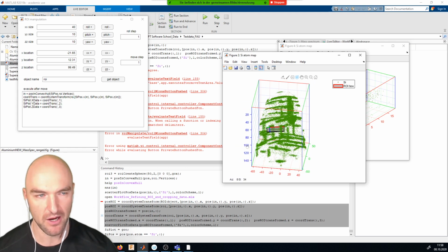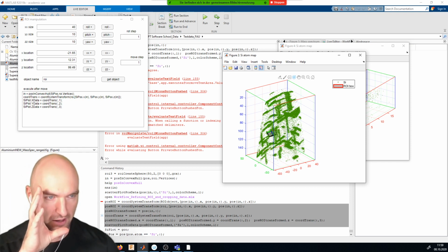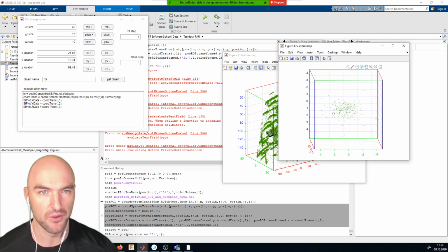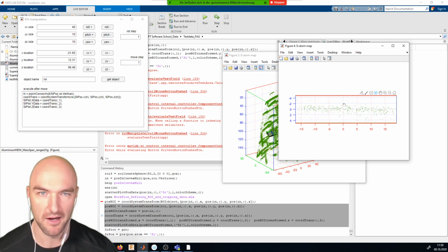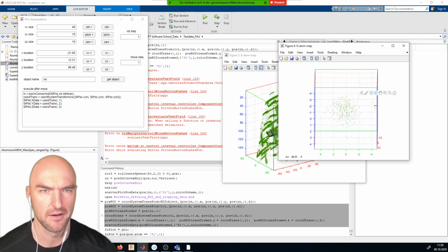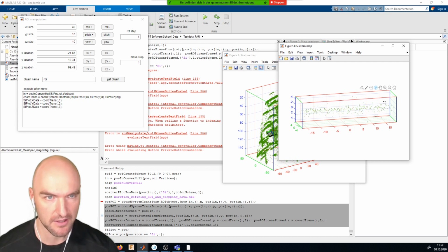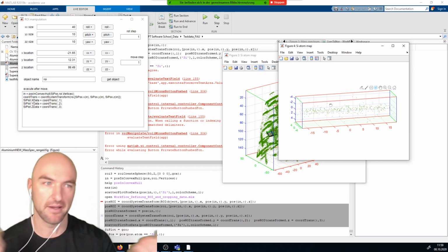So this object now, by the way, exists independent of any plotted data, right? So you could use that either on those single things here, or on some other copper or whatever. I might just adjust the pitch a little bit because it's not quite perfect, but I think now we're pretty well aligned. Because you can, for example, then use this to create a line profile along here. Obviously, you might want to make it a little bit smaller.